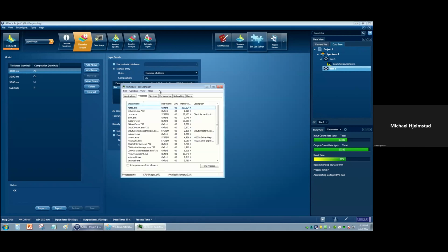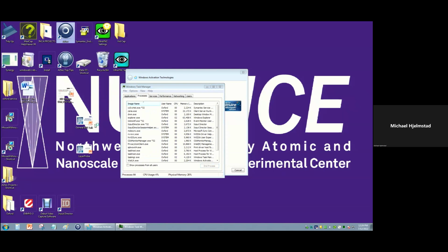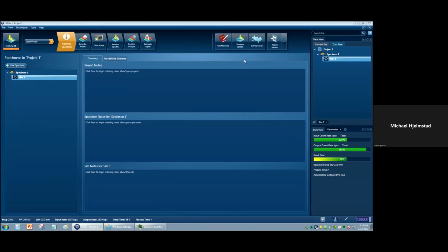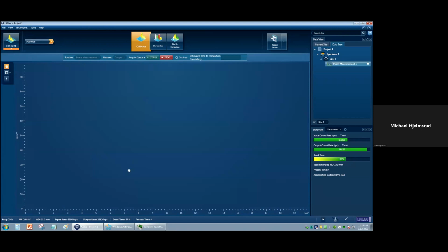All right, I'm going to move past that. And I apologize that I can't share that with everybody, but basically the setup solver part of the software is really a means of helping you through the idea of what might be a good setup, in terms of all these different materials, what's unknown, things like that. What's the appropriate accelerating voltage that you use? In this case, it might have told me a lower accelerating voltage. It's just making a recommendation to me based on a couple of things here. So again, I'm just going to retake the optimization one time, and then we'll actually go to the sample here.